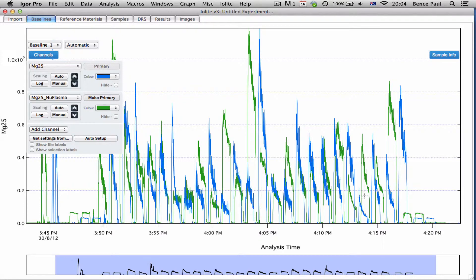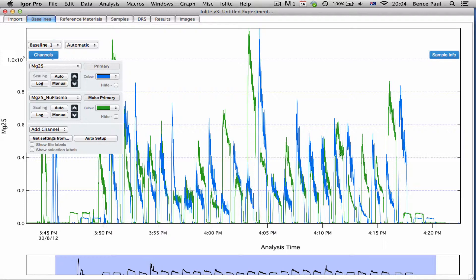We can see that the two are offset and that's due to differences in the tube length and also differences in the computer clocks for each mass spectrometer.